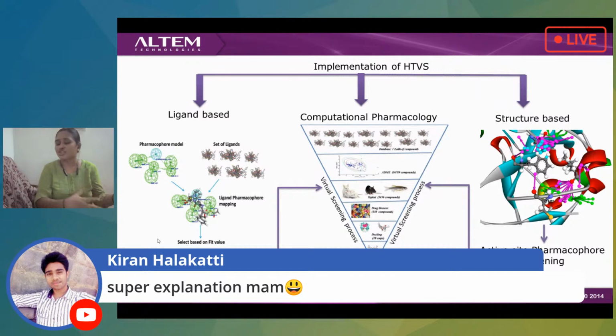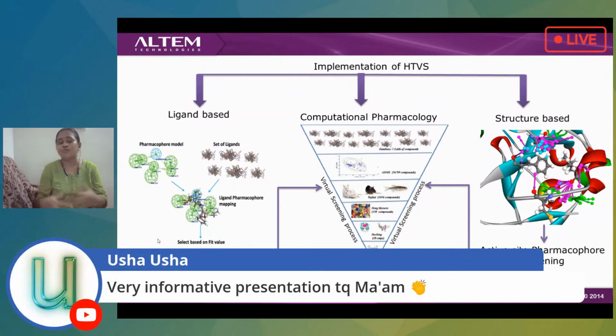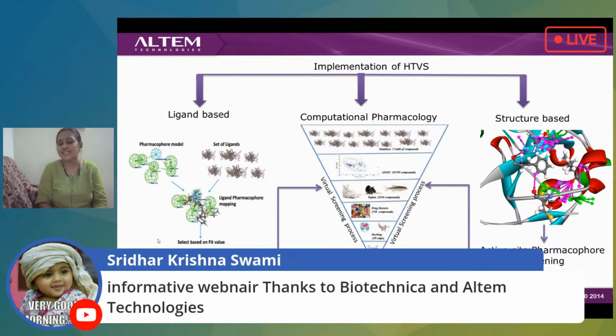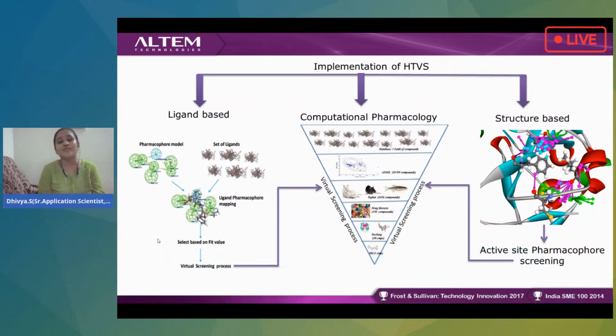We have regression and Bayesian categorization models to understand more about the toxicity behavior and pharmacokinetic behavior of the drugs. Additionally, we have molecular simulation tools to understand the simulation of your cells and atoms in various environments, and the drug interaction in the water environment, using explicit solvent or implicit solvent technology.